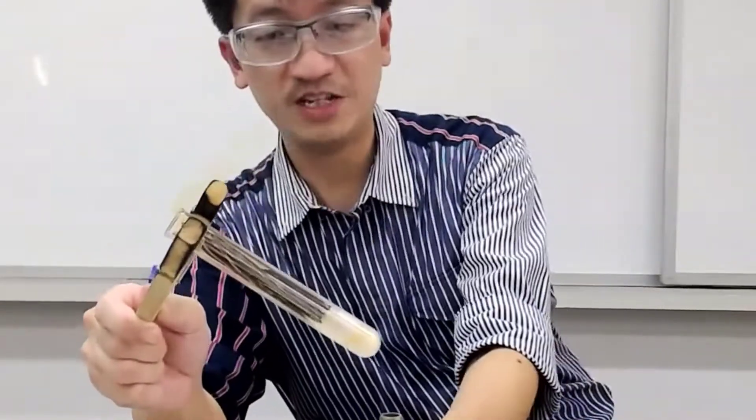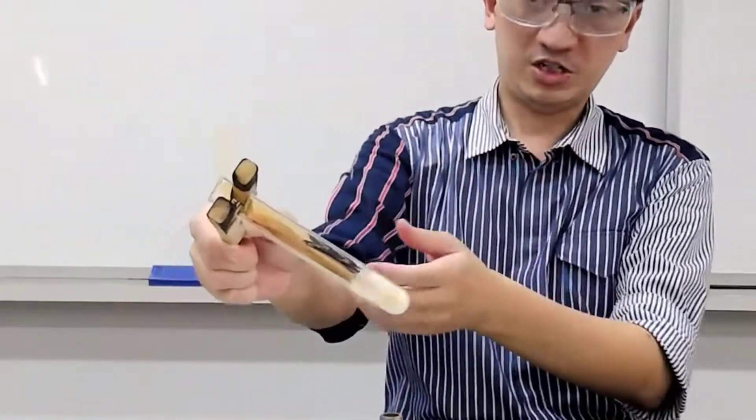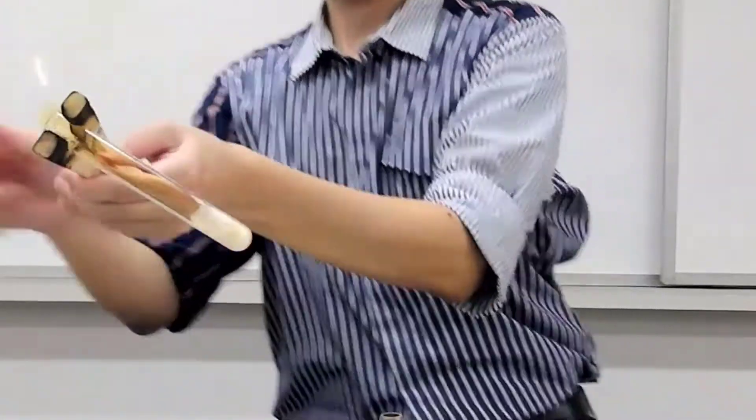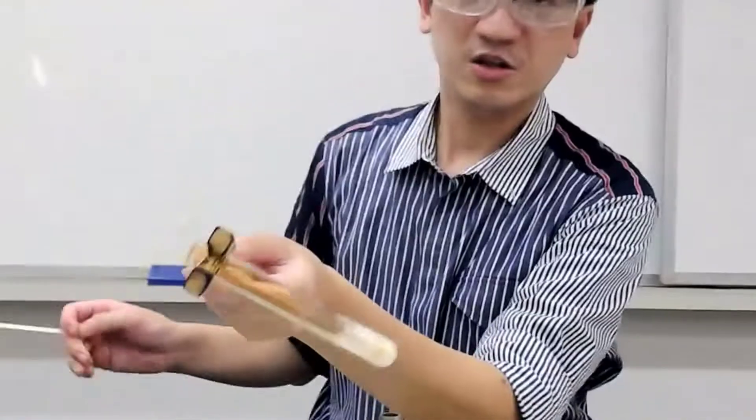If you study carefully you should be observing some oxygen given off. We're going to test the oxygen given off with a glowing splint.